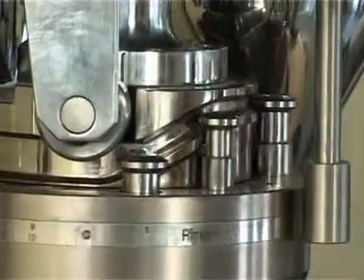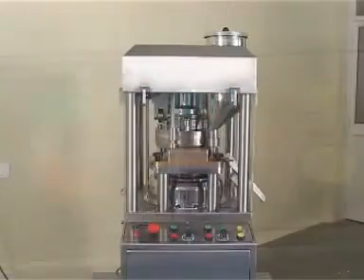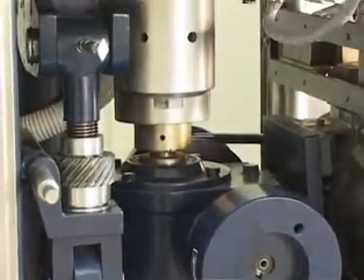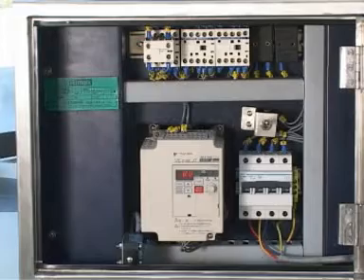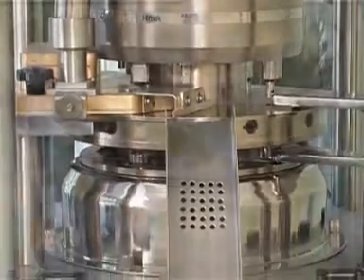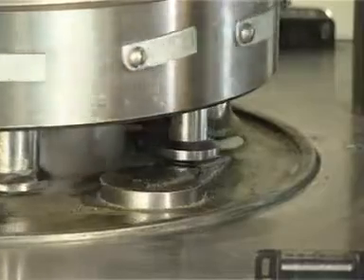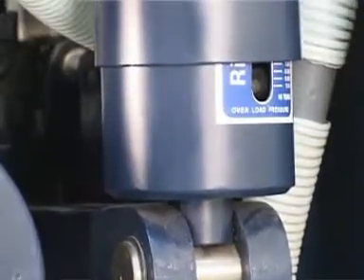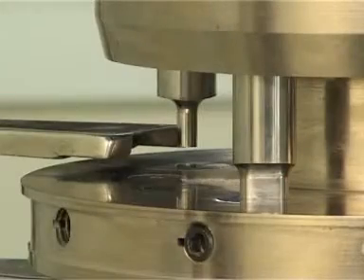The machine is equipped with all mandatory safety features, built ergonomically to make it an operator-friendly machine. The main components of the Mini Press 2 are: gearbox and main motor assembly, AC variable drive and electrical circuit panel with limit switches, turret, upper and lower cam tracks, upper and lower press rolls for main and pre-compression, weight adjustment assembly, overload pressure release assembly, feed frame, force feeder assembly with motor, hopper, and dust extraction nozzle system.